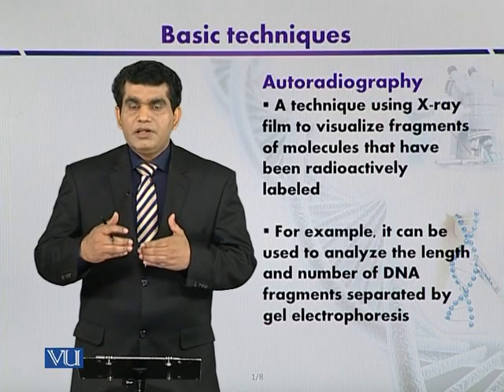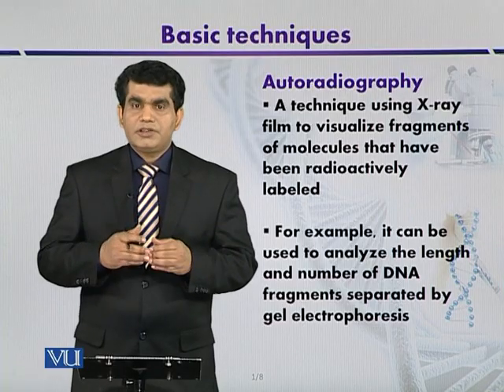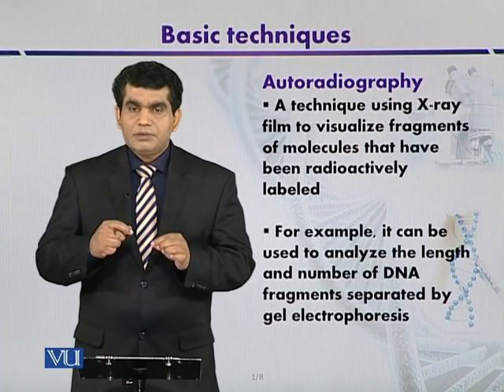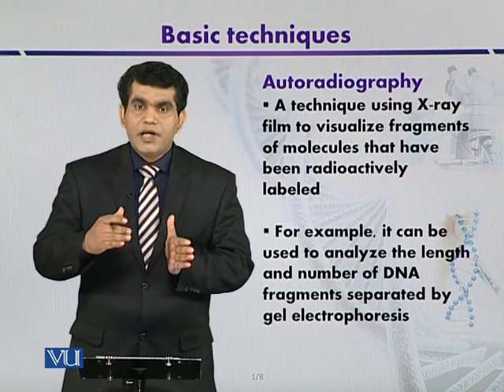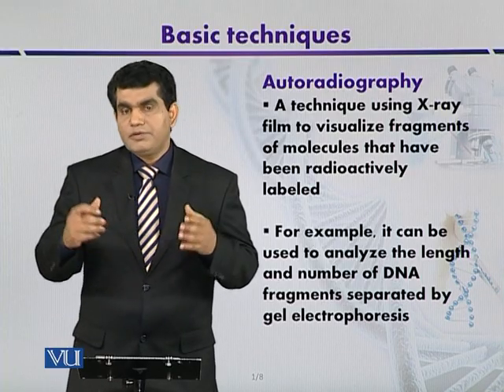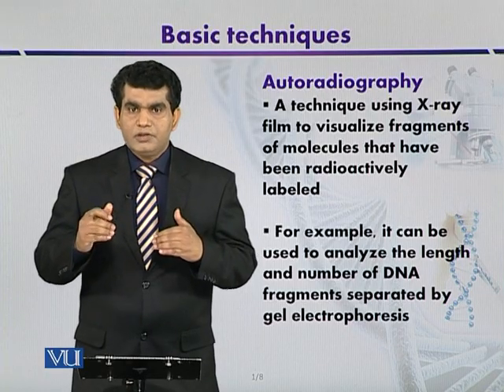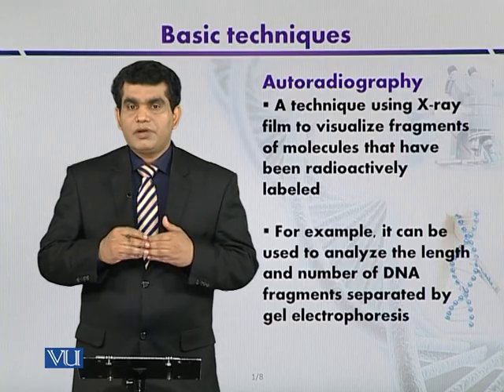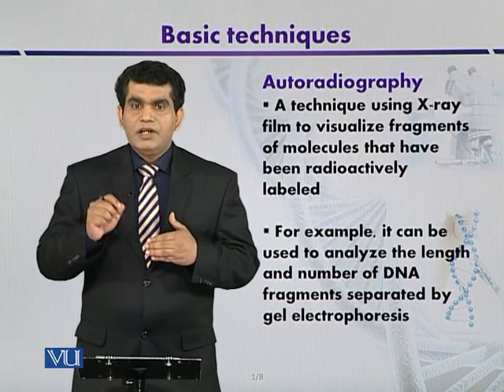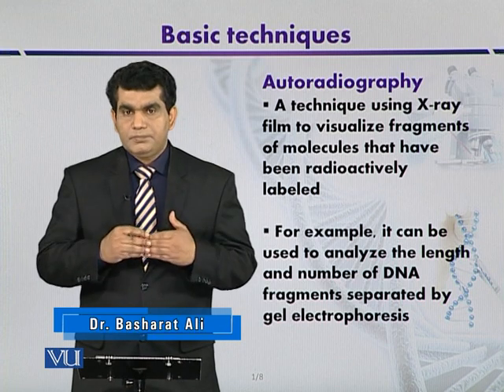So if DNA has been immobilized and it has been hybridized with a labeled probe, then this membrane is kept in contact with X-ray film. When it comes in contact with X-ray film, a dark band will be formed there due to the emission from the radioactive substance, and that dark band will indicate the presence of DNA.